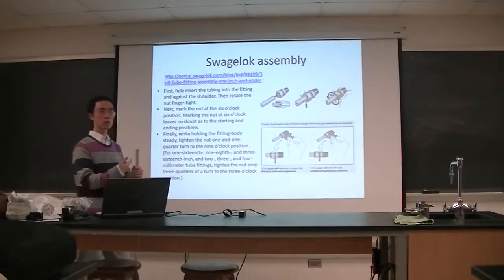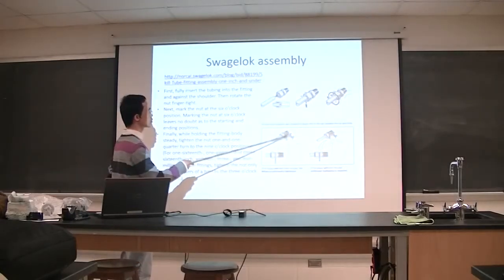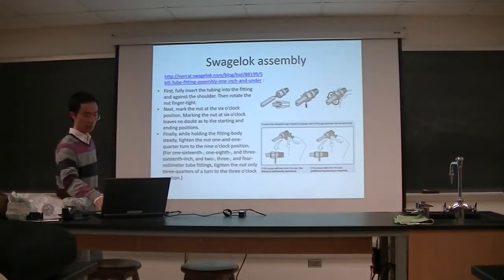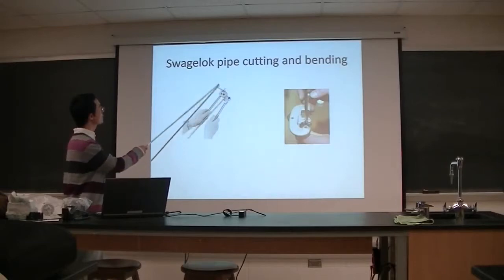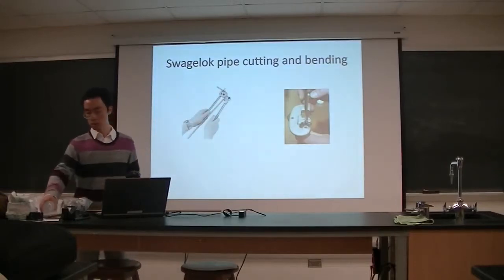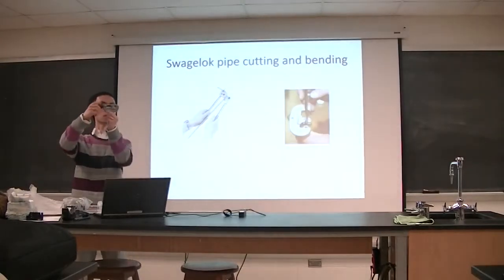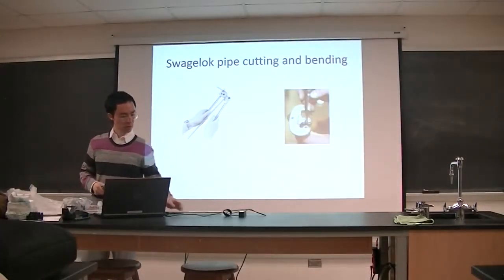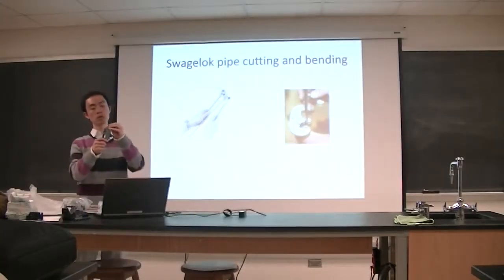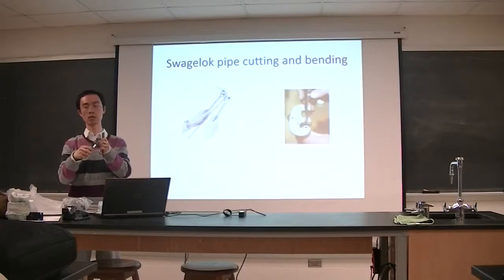You have special tools to bend and cut pipes. To cut: you have a rotating blade and a pressing part. Place your pipe in between, rotate it one full round, then tighten to apply pressure, and rotate again. After several rotations, the pipe is cut through.